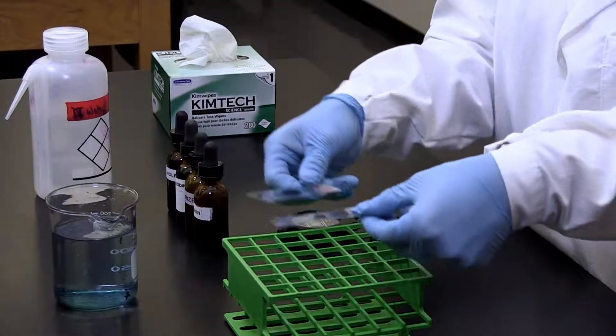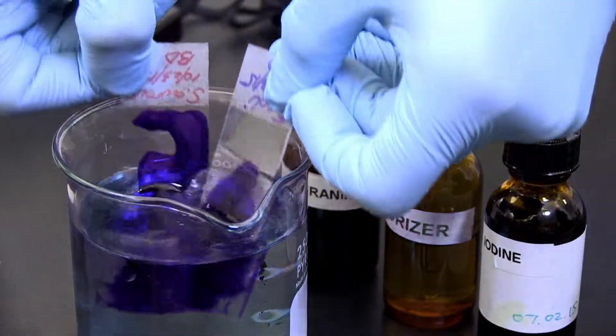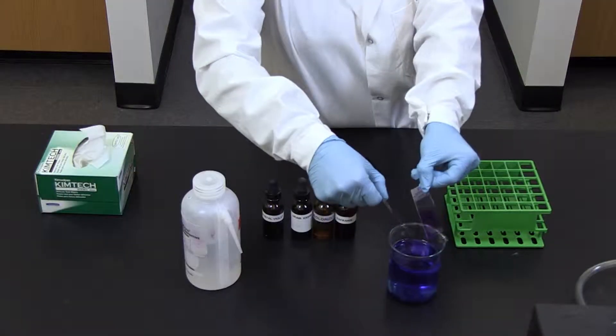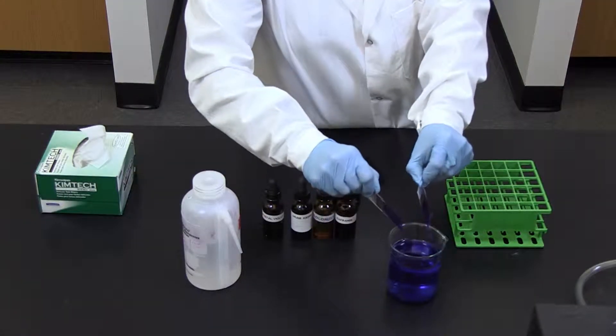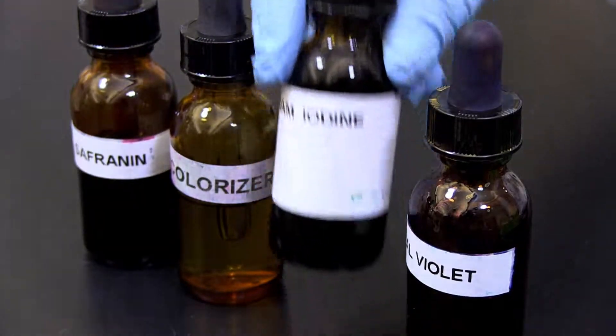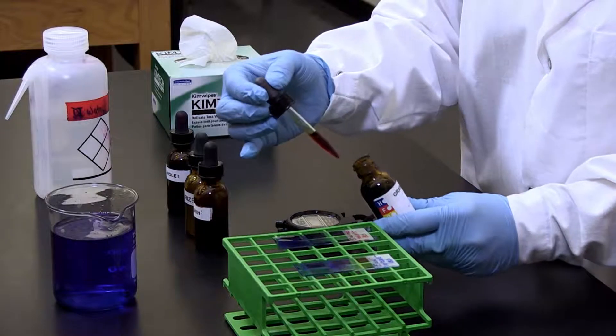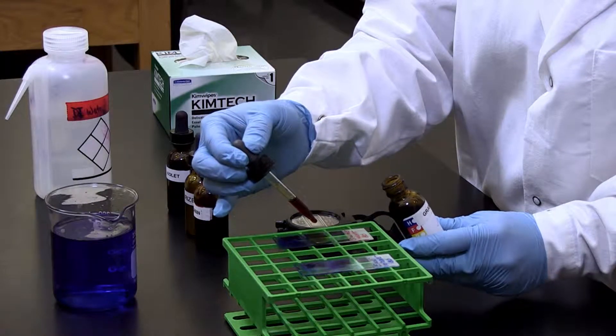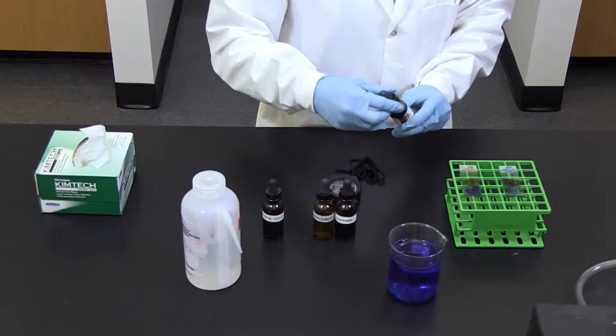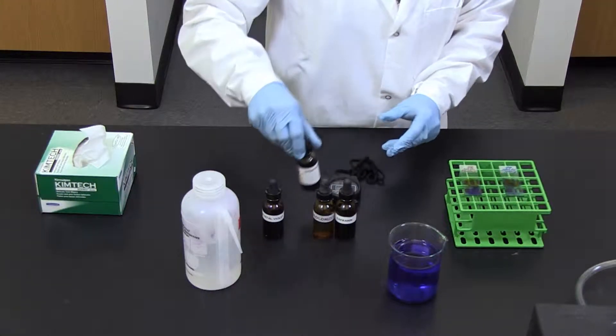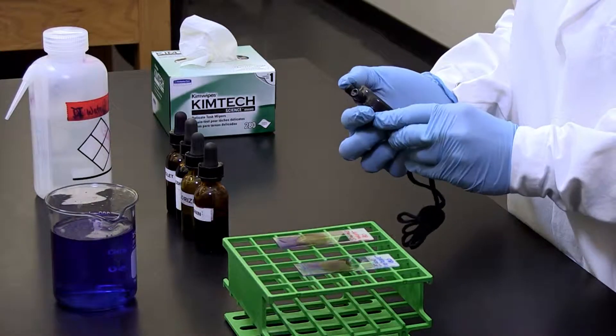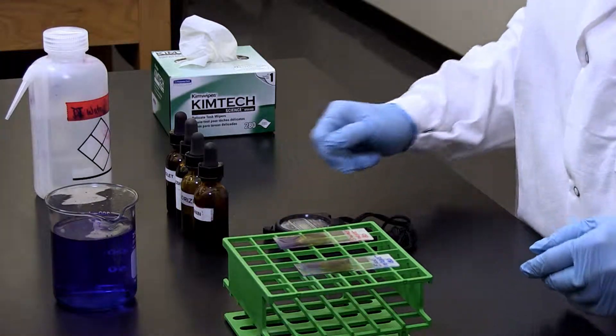Three, briefly, about 3 to 4 seconds, rinse the excess stain from the slides and drain off the excess water. Four, cover the smears with Gram's iodine for 60 seconds. Iodine is added as a mordant, which is a chemical that serves to fix a dye in a staining process. In this case, the iodine binds with the crystal violet to create an insoluble complex within the thick peptidoglycan layer of gram-positive cells.